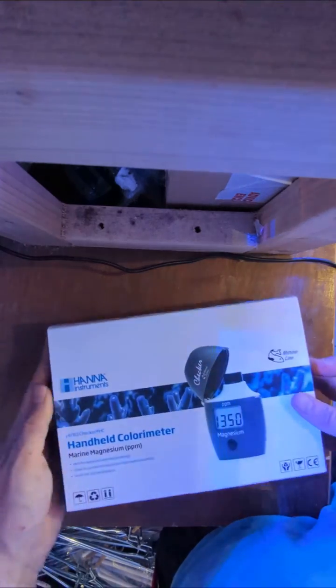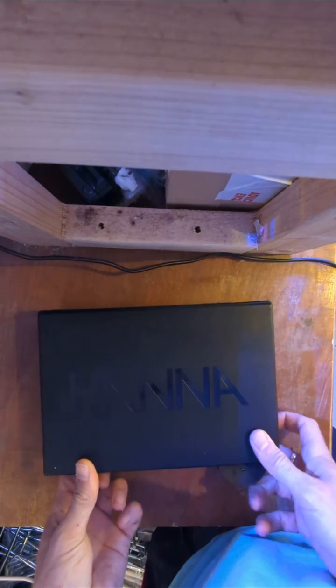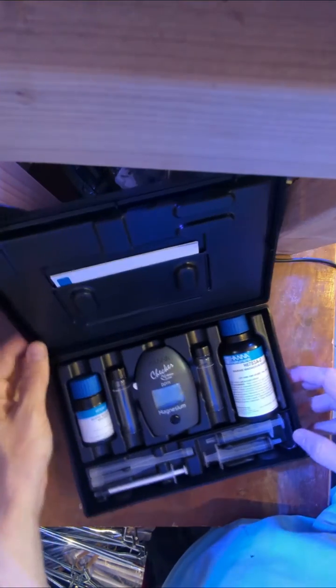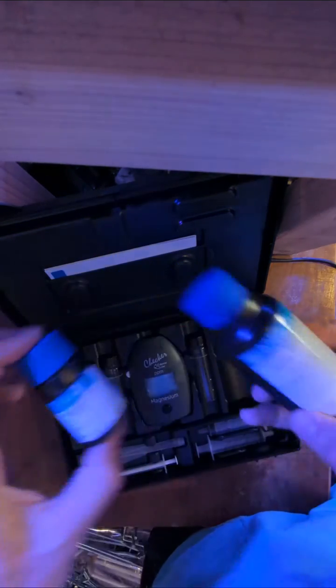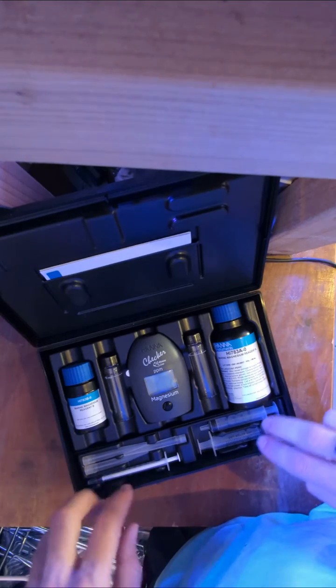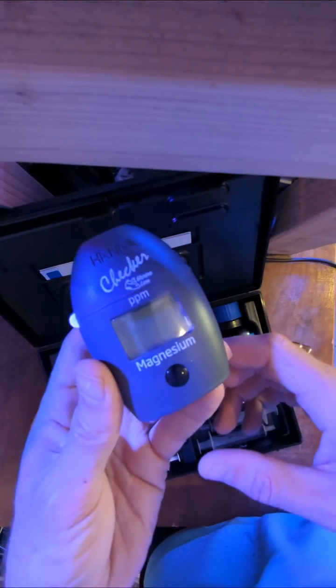The new HANA magnesium checkers are here and this is the first one I'm going to unbox. So it's two reagents, two cuvettes as normal with HANA, three syringes, a few tips, and there's the tester.